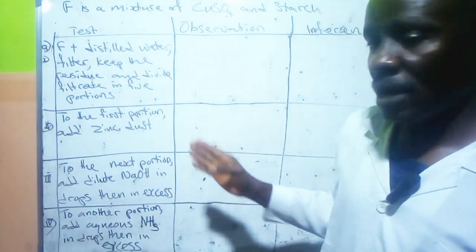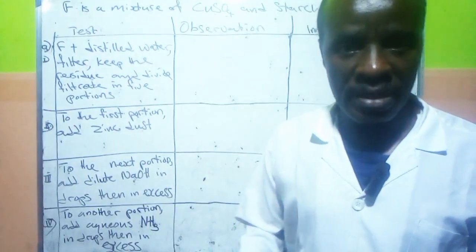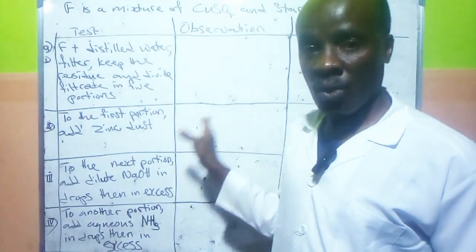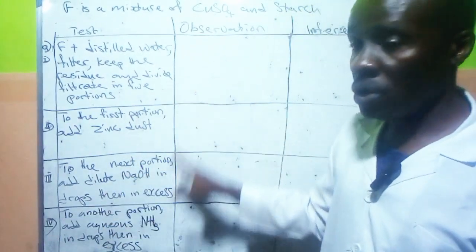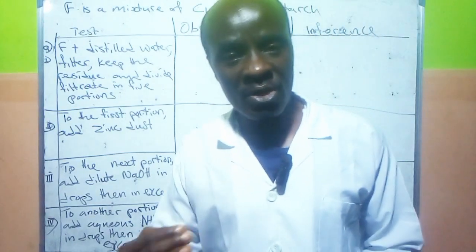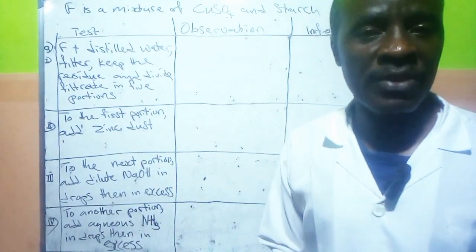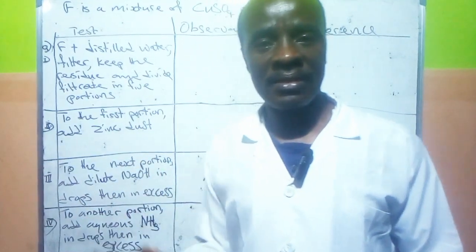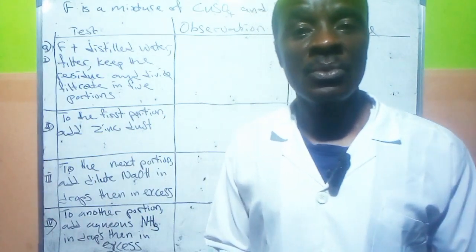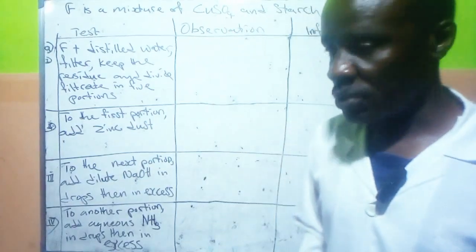So if you are preparing for this exam, I want you to pay attention, get your pen and paper and watch as I do all the experiments, all the tests for you. All the tests I'm going to show you here, at least 4 or 5 of them you're likely to see, just like the alternative A. What I analyzed, at least 4 of the tests appeared. So pay attention and watch as we get along.